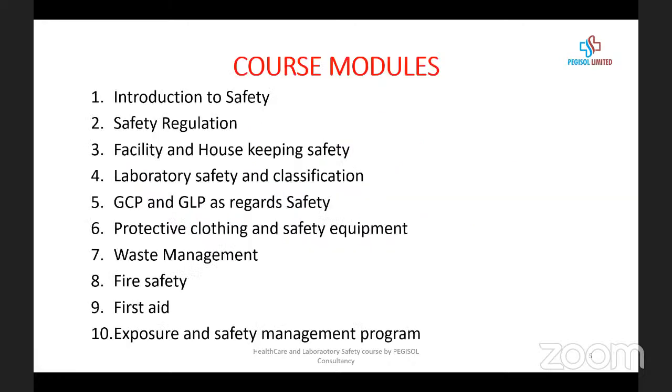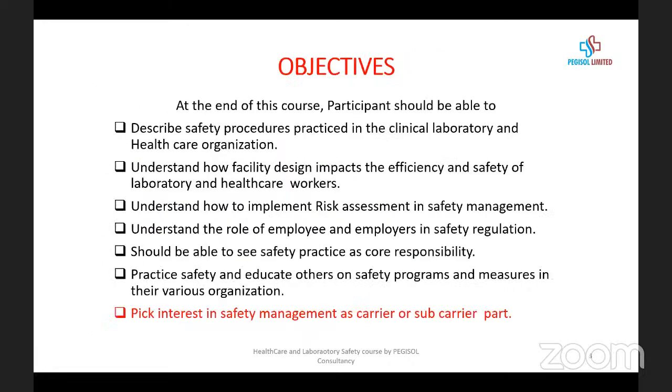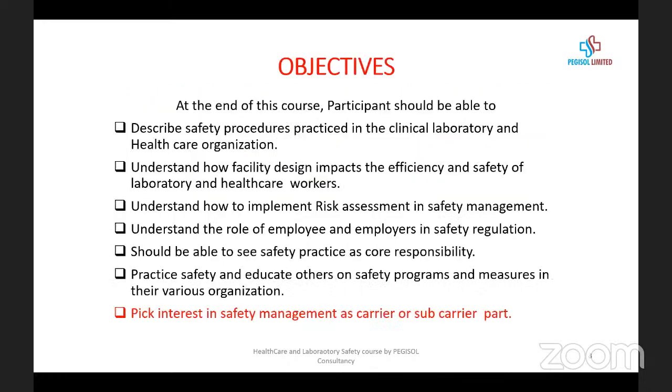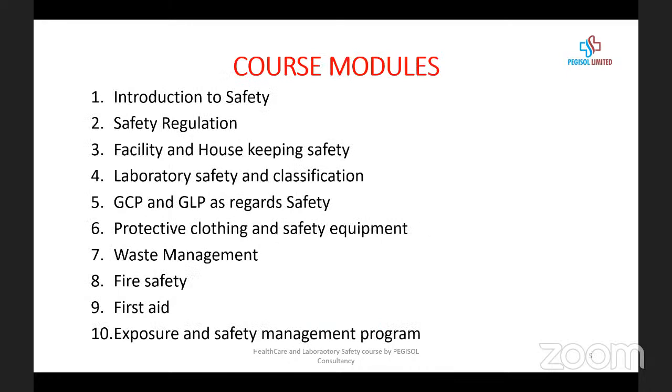During the course of this safety, healthcare and laboratory safety program, we have looked at Module 1, which is Introduction to Safety. We looked at safety regulation. We looked at facility and housekeeping safety. We've also looked at laboratory safety and classification. We've also looked at good clinical practice and good laboratory practice as regards safety. We've also looked at protective clothing and safety equipment. That's what we're going to be looking at today.